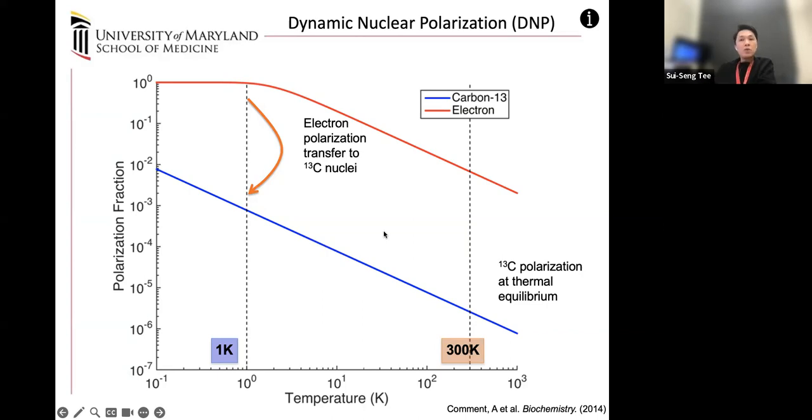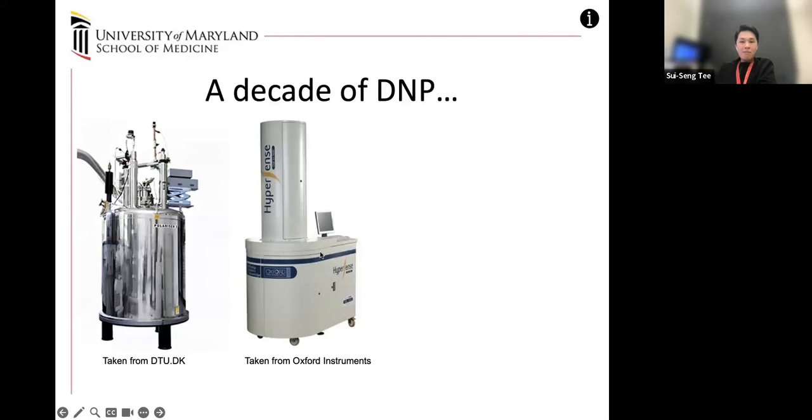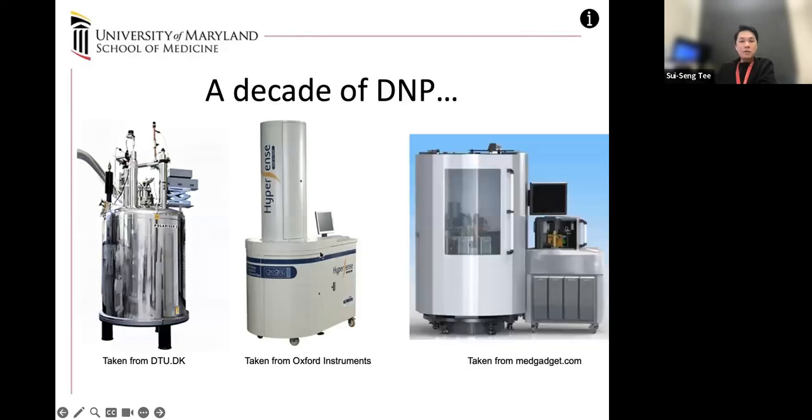And what can we do with this, right? So it's now about 20 years that this technology has been around. When I was a PhD student in England, the machine sort of looked like some version of R2D2. But it slowly progressed to the point where GE, the company, now makes clinical polarizers, right?